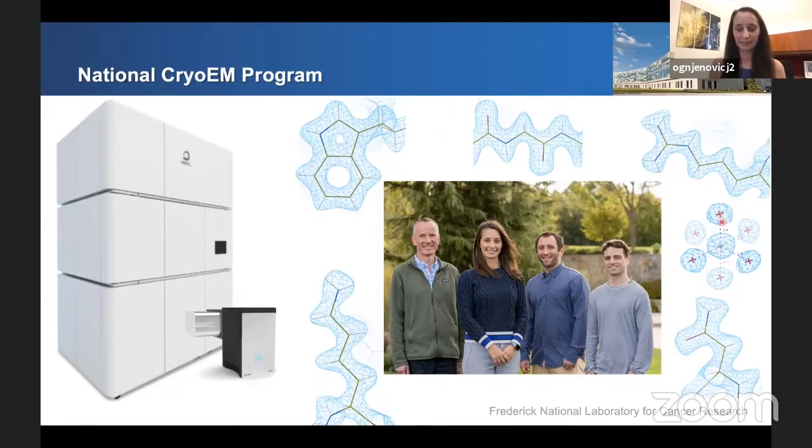At the time when we started this project, there was a lot of skepticism around cold FEG, as despite the possible theoretical advantages, there were no practical demonstrations of its usefulness. And a lot of people actually thought that cold FEG data collection with the Cryo was more trouble than it was worth. But we wanted to explore potential benefits of collecting Cryo data using a source with such high coherence, especially once it became obvious that automated tip flashing with the software would actually keep the beam intensity sufficiently stable over the course of data collection.